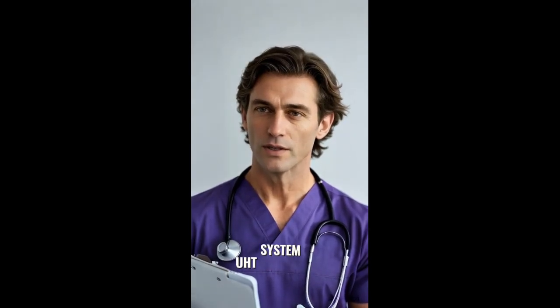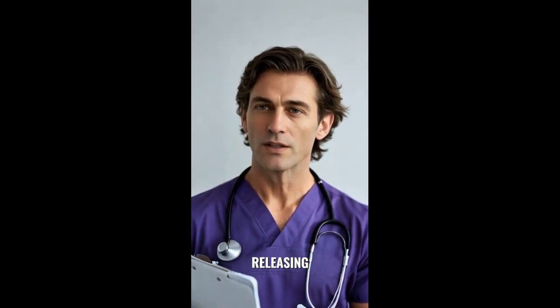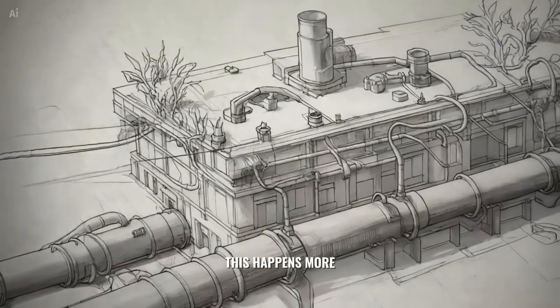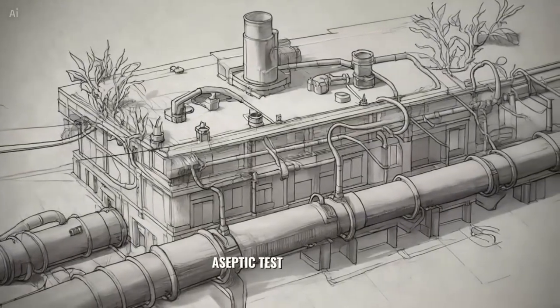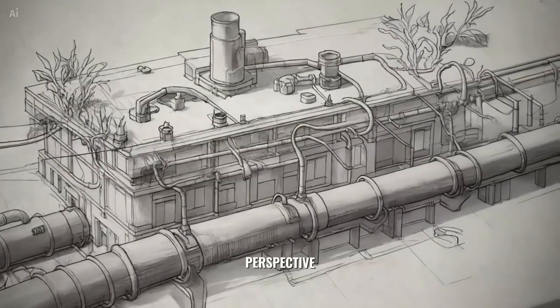You might have a perfectly designed UHT system, but if your aseptic testing isn't properly validated, you could be releasing contaminated product without even knowing it. And yes, this happens more often than people admit. Today, I'll walk you through how aseptic test validation really works from a practical perspective.